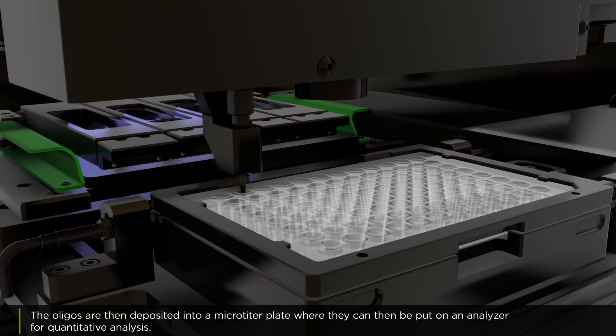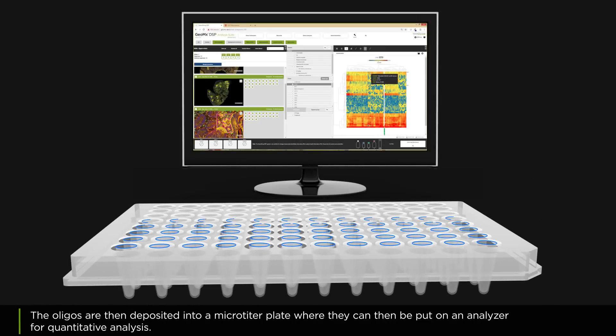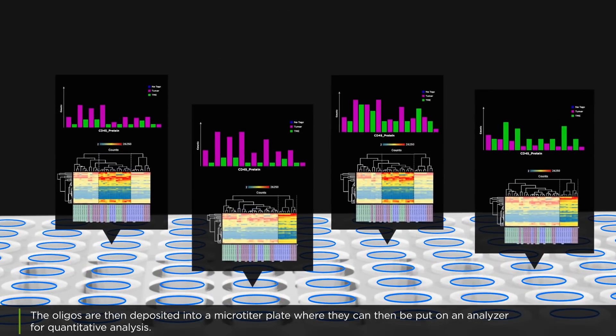The oligos are then deposited into a microtiter plate, where they can then be put on an analyzer for quantitative analysis.